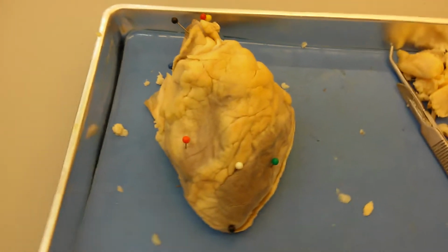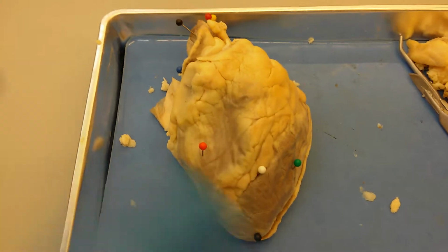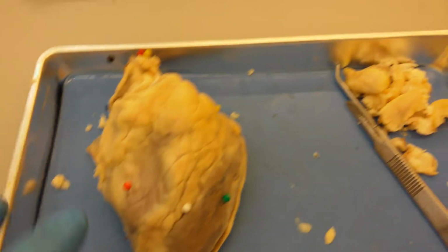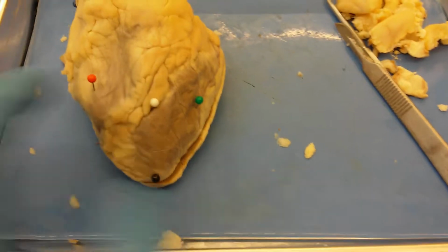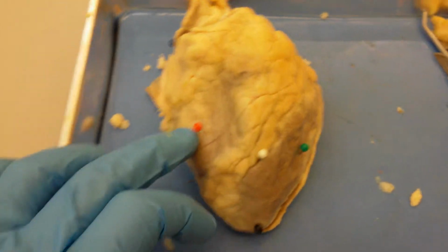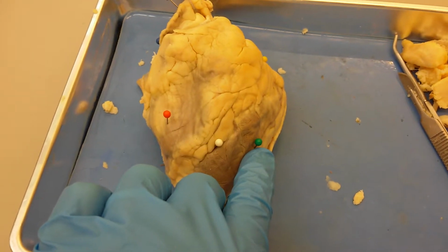Okay, so we're going to do a short overview of the sheep's heart. So here we have the heart in the anterior view. In the anterior external surface, this is the apex of the heart. And then you're going to have two ventricles. The red pin represents the right ventricle. The green pin here represents the left ventricle.